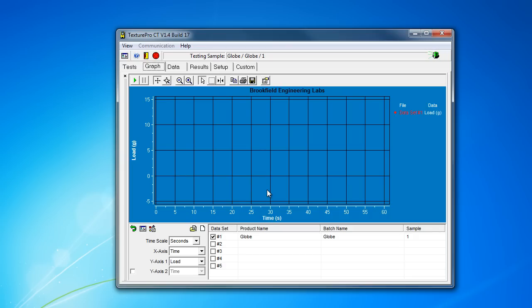The machine, it's not nearly as fast as I've seen. It tends to take its time going down. Not as much flexibility and it tends to be pretty loud, especially if you're in a relatively quiet environment.